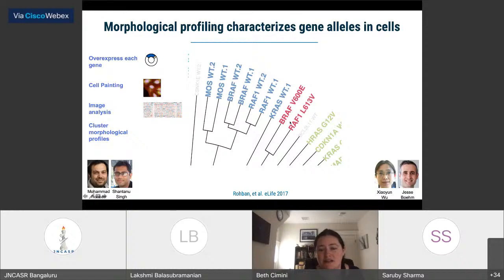And in the next cluster over are some mutations, disease-causing mutations in BRAF and RAF. And you can see they're not clustering with the wild types, but they are clustering quite close to them. So this gave us some confidence that you could actually detect, not only could you sort genes correctly into pathways, but that the connections between individual pathways were actually informational.